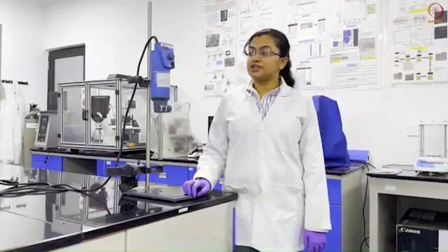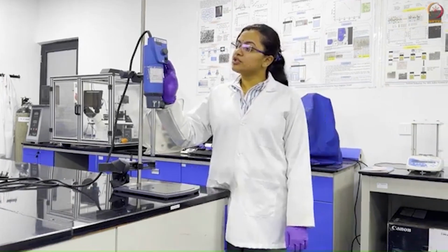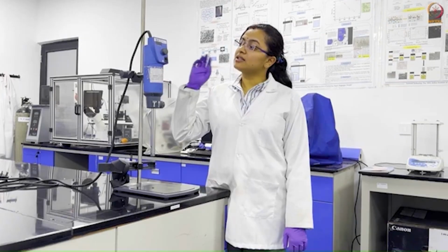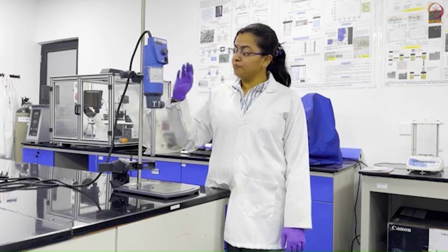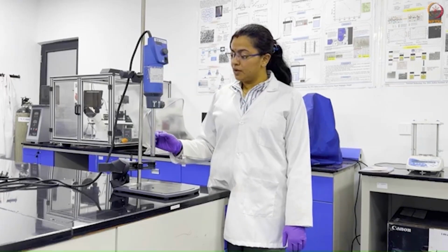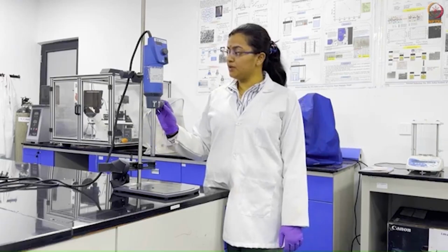Welcome to our demonstration on the T25 Ultra Turrax homogenizer. This is the switch on and off switch. Then this is the RPM control from low to high, and this is the shaft. We can unplug the shaft and afterwards clean it from here.